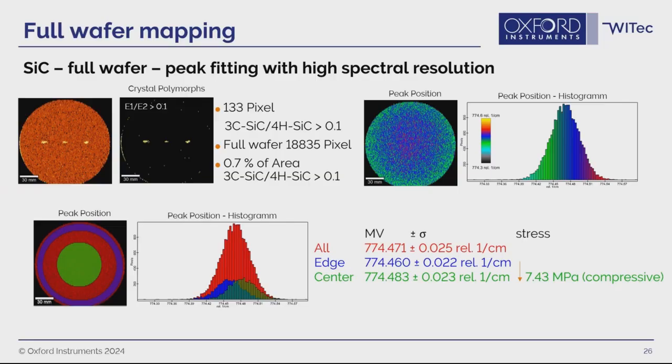These were two examples of silicon carbide full wafer imaging. Both were recorded with 532 nanometer excitation wavelength. I wanted to give you a short impression of what we can do with the data, what we can evaluate. And of course, this information helps the producer or academia to characterize the materials and to make them better in the end.